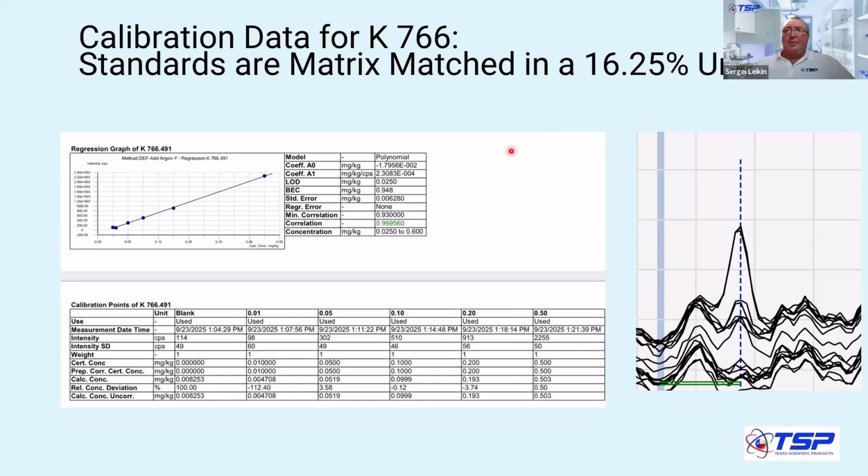Here you can see in this data that the 0 and 10 ppb solutions are on the same level as the blank, but it clearly separates 50 ppb. So your detection limit here is probably somewhere around 25 ppb, probably quantifiable like that. That is the effect of getting additional gas, on top of being able to run it reliably. That's the point here.